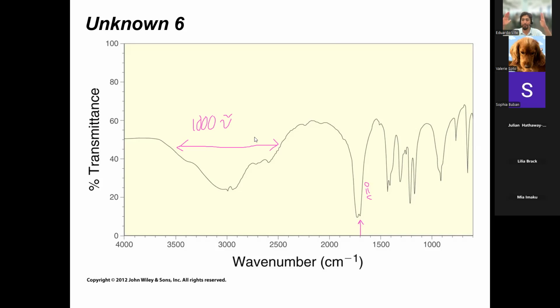OH in general gives very broad signals. Sometimes they're broad, but not too broad. Sometimes they're extremely broad if they are part of a compound functional group. And again, this spectra specifically is not very good, right? You're not always going to have perfect spectra, but you should still know the regions and what to expect. So we have OH and we have carbonyl.